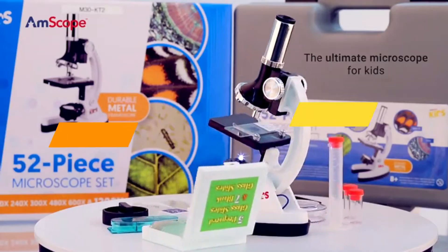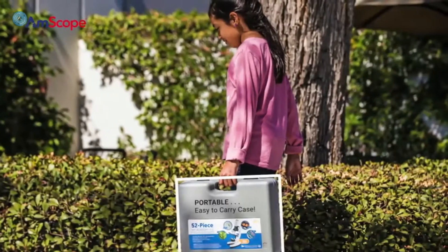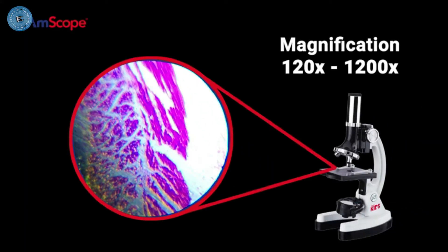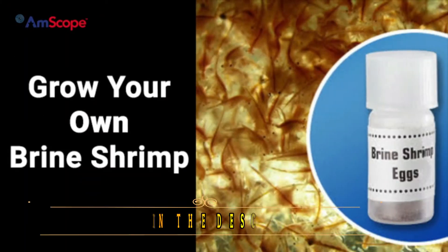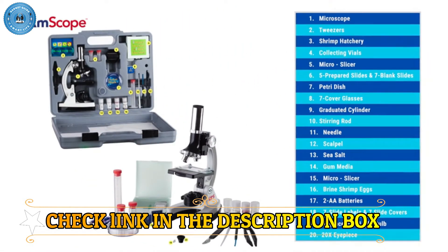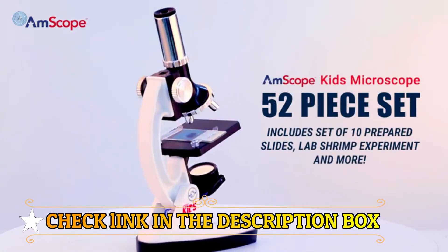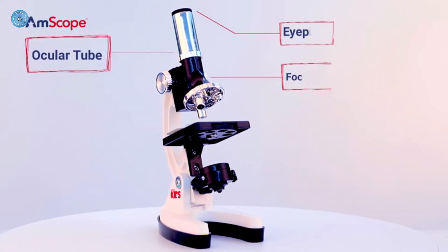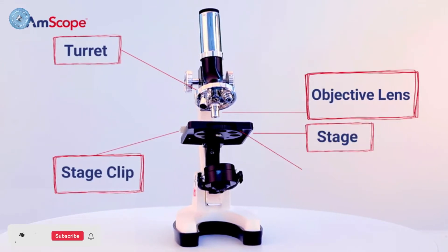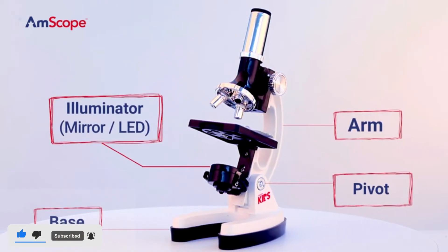Number 5: Amscope Kids Beginner Microscope. This beginner compound microscope provides high magnification for educational applications. It features a monocular viewing head with LED and mirror illumination and a built-in color filter wheel. Wide field view, single layer stage with clips. The forward-facing rotating turret provides 120x, 240x, 300x, 480x, 600x, and 1200x magnifications. Coaxial coarse focus has a rack and pinion focus mechanism on a durable and stain-resistant white metal frame.